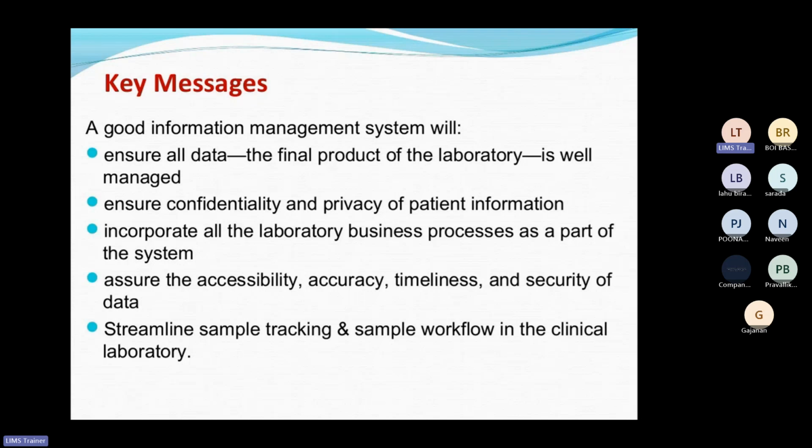Then the different timelines, then the security of the data. All these things are important. Also, one more very important aspect is that you all understand the validation of the different instruments and equipment, validation of the different products and their batches, and then the calibration of the instruments.